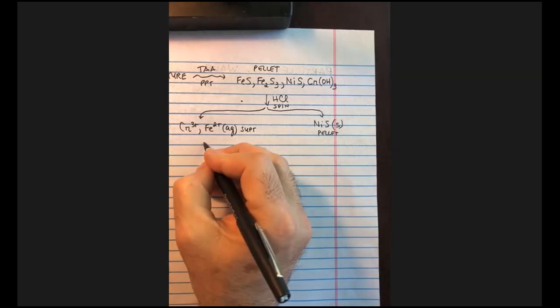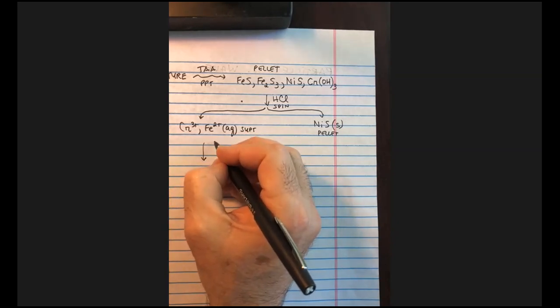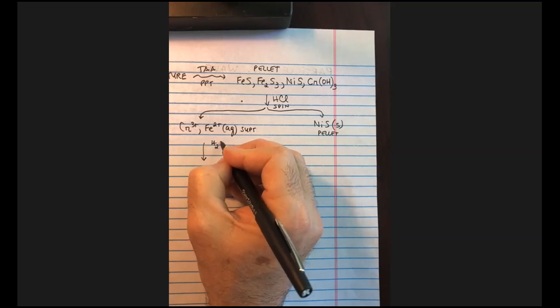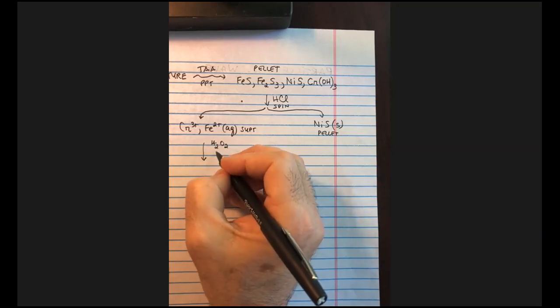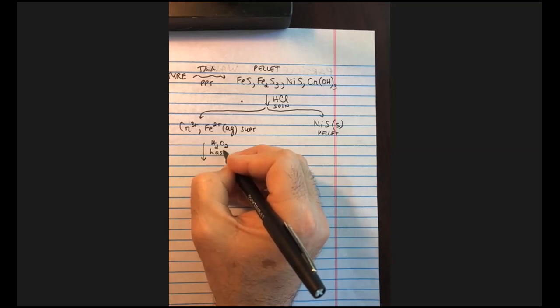Okay, now what we'd like to do is take the chromium and essentially convert it into a different form. So what we're going to do is, again, add hydrogen peroxide at a basic pH.